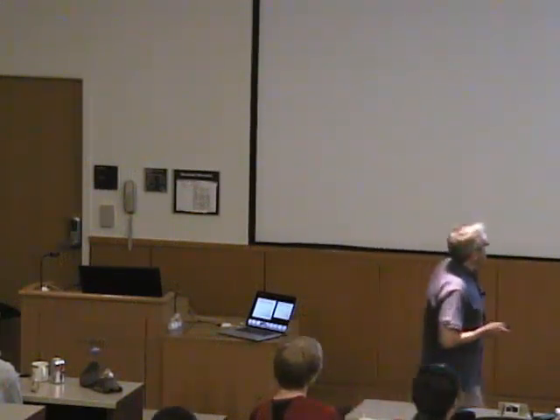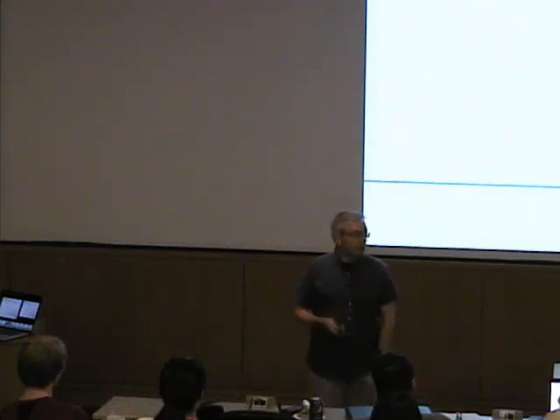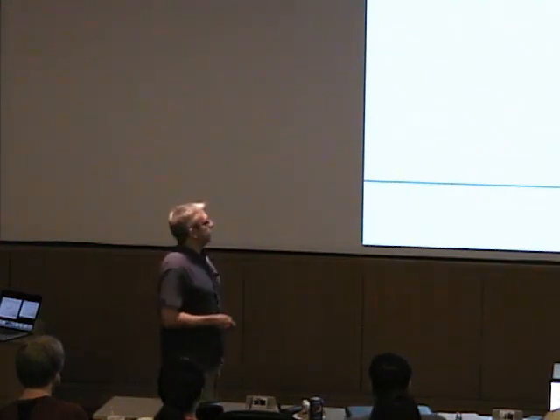So if we want to visualize Bragg's law, he said, well, what's happening? We have a crystal, okay? And that crystal is hit by an X-ray beam. Of course, this X-ray beam will be diffracted, but what we see is an outgoing beam that looks like it was reflected on some set of lattice planes.